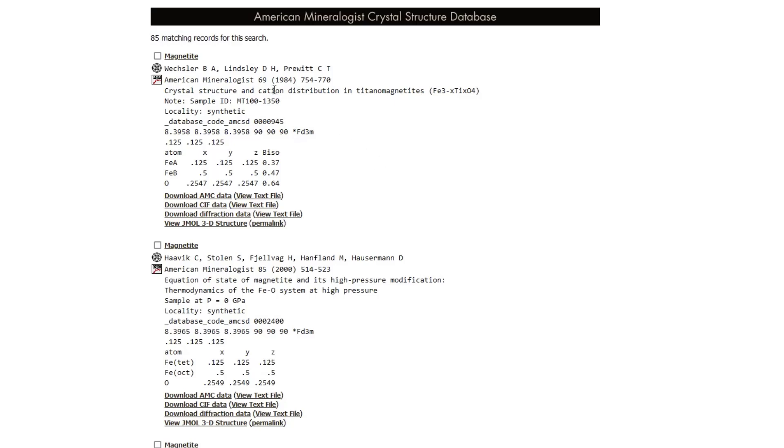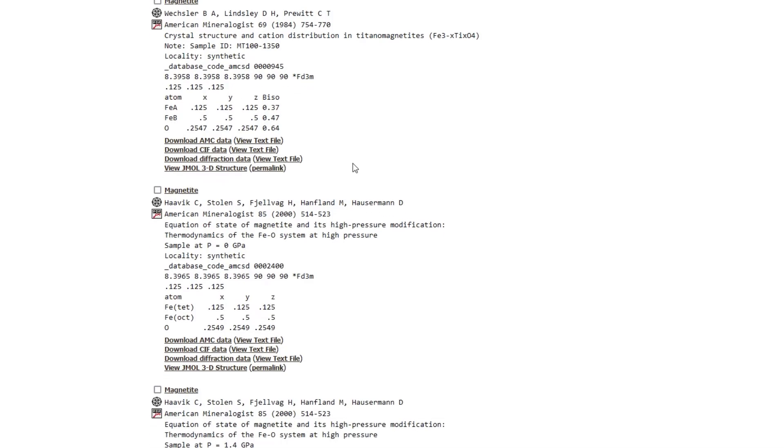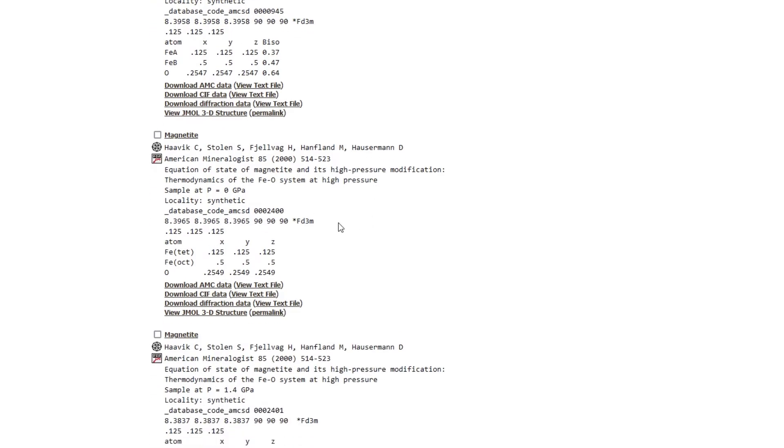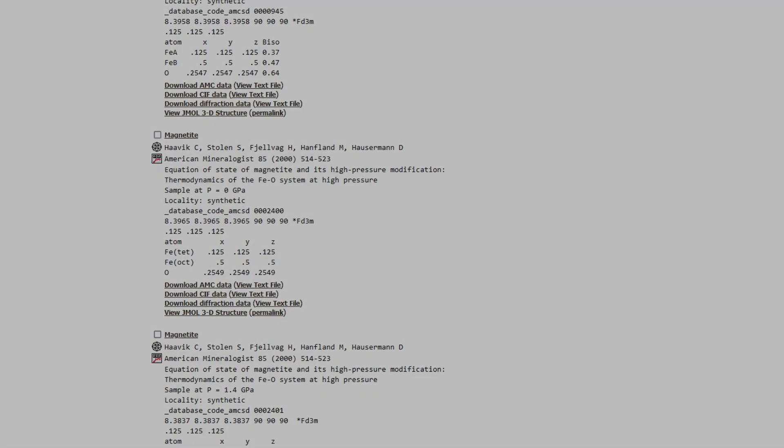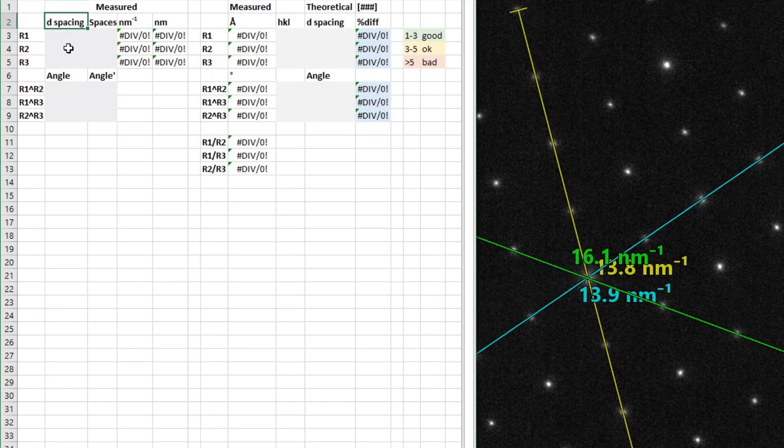So what you want to do is you could look at the year it was published because if it's really old, maybe it's not so accurate. Some of these aren't pure minerals, like that titanium magnetite. Maybe we don't want titanium. Some of these might be high pressure phases. In this study it was a high pressure study, but this was done at zero GPA. The materials might be synthetic or natural. In any case, once you find a good match, you can download the diffraction data. You can also download the CIF file which we can use in single crystal. I'll talk about that later.